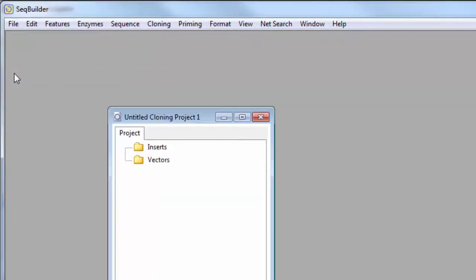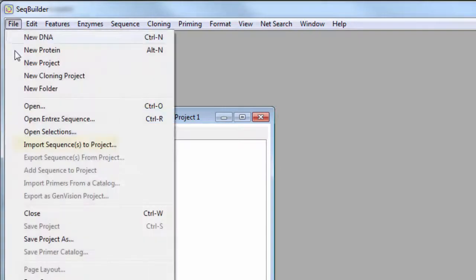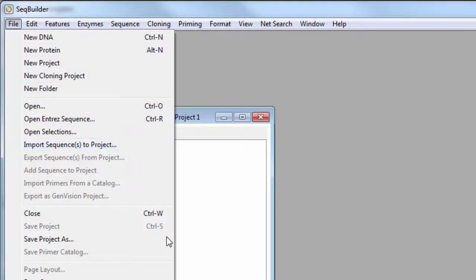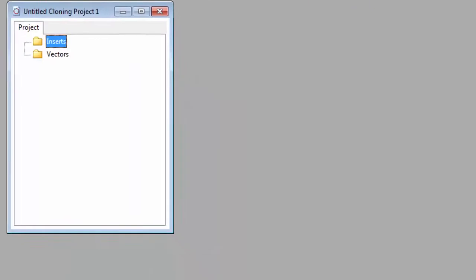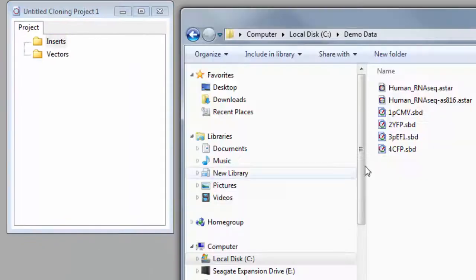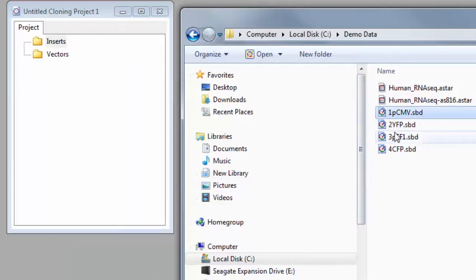From the Cloning Project window, select the Inserts folder, and then add your insert sequences by going to File, Import Sequences to Project, or just drag and drop them into the folder.